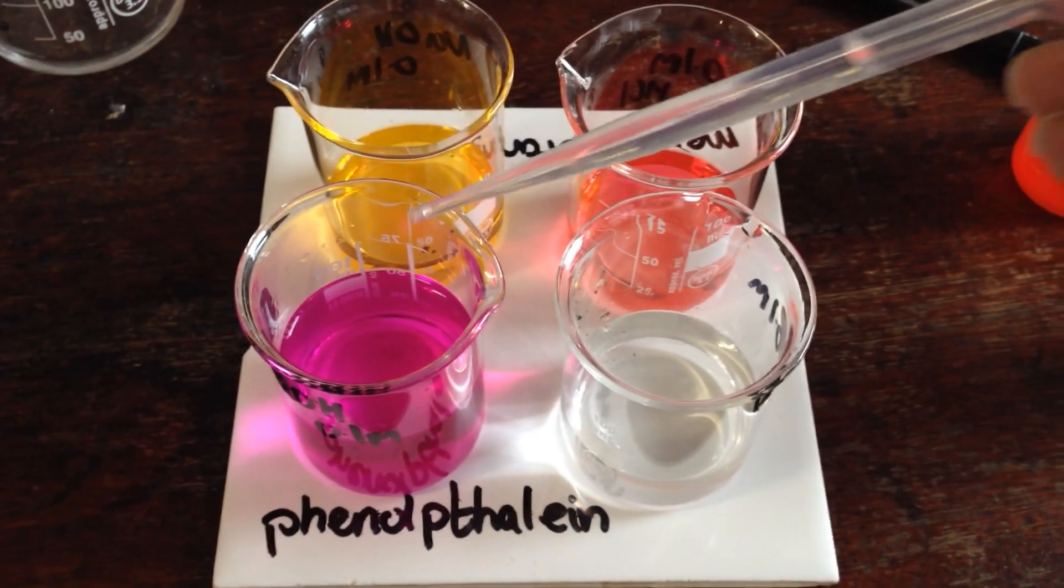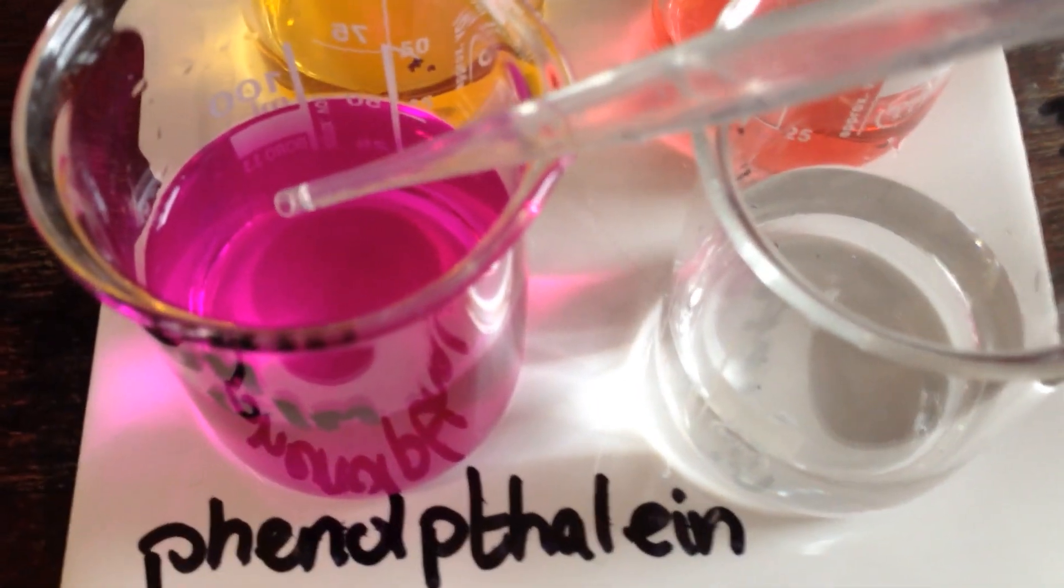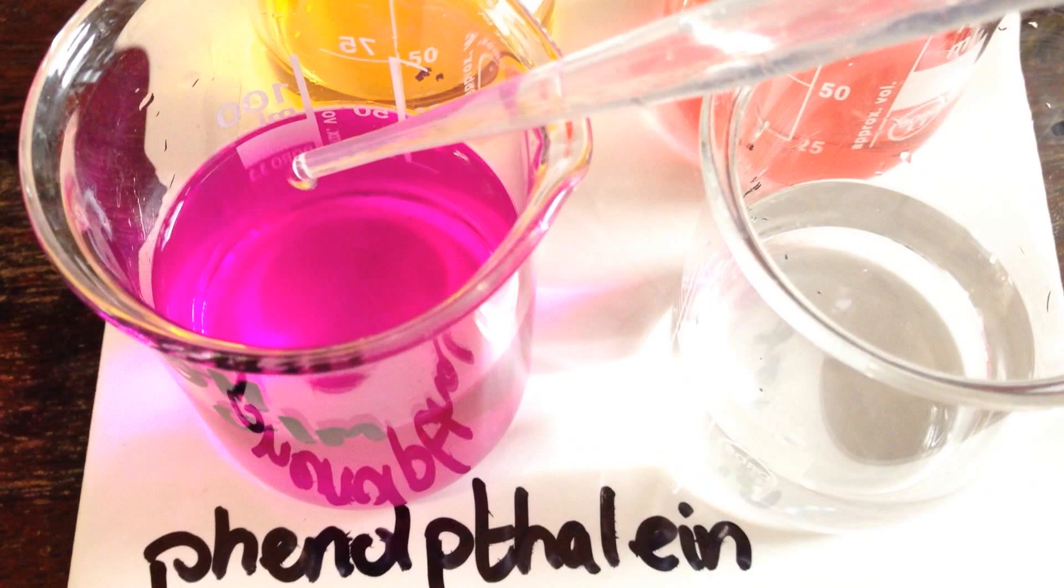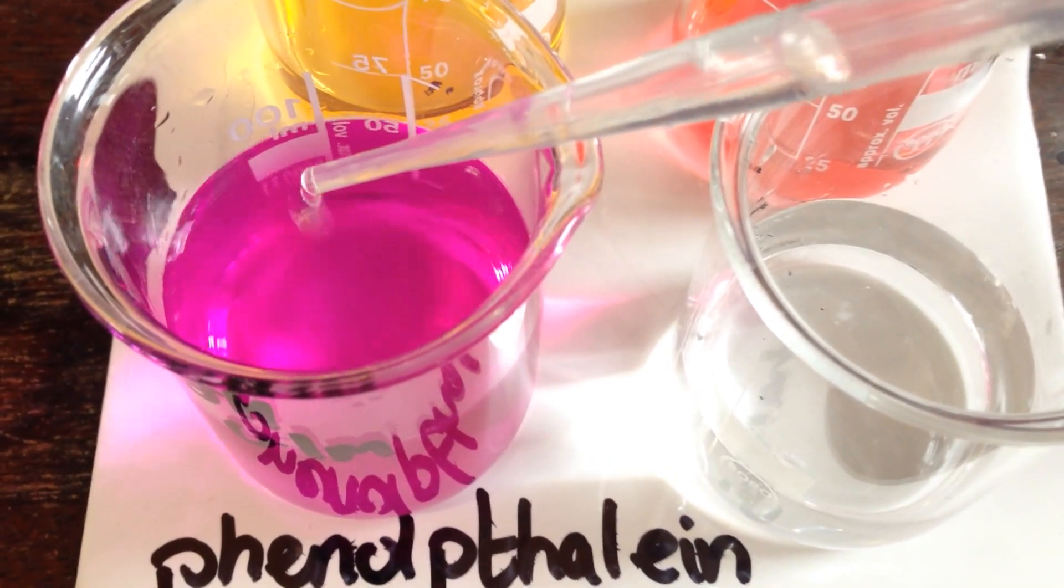When looking for color changes, you need to go drop by drop. Going a bit closer, you'll start to see that when acid is added to the alkaline, we're getting a little bit of a change in color.